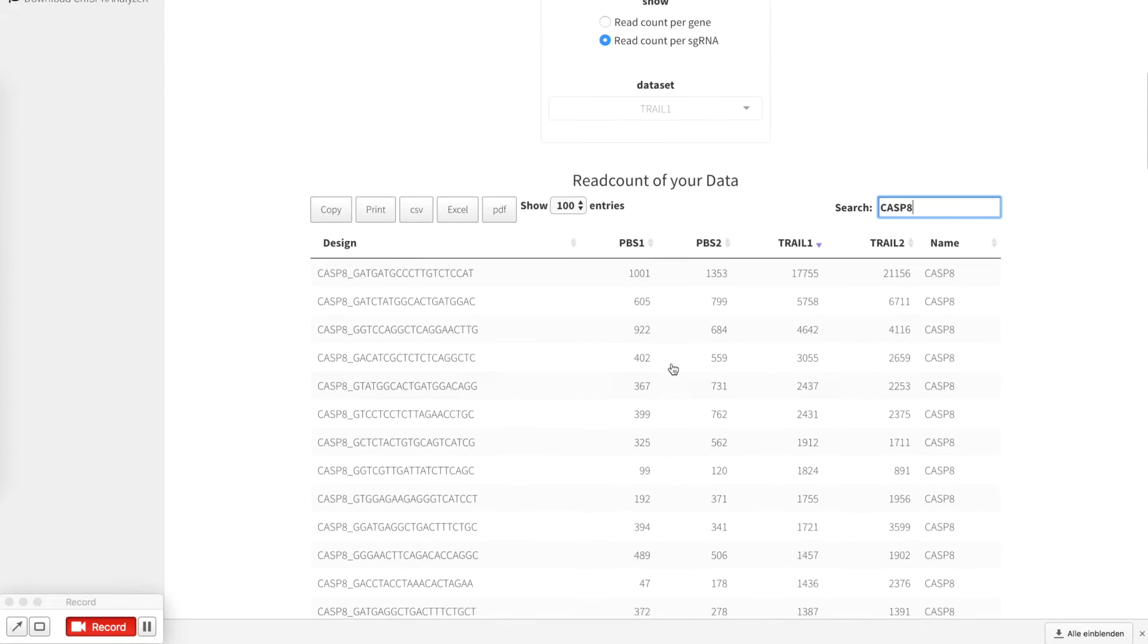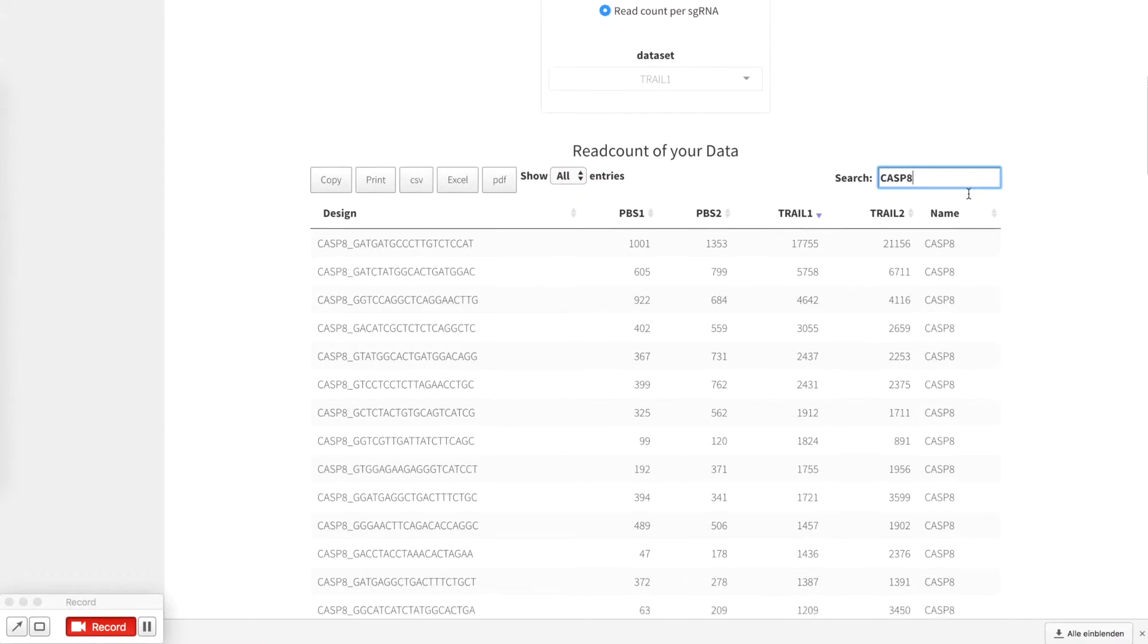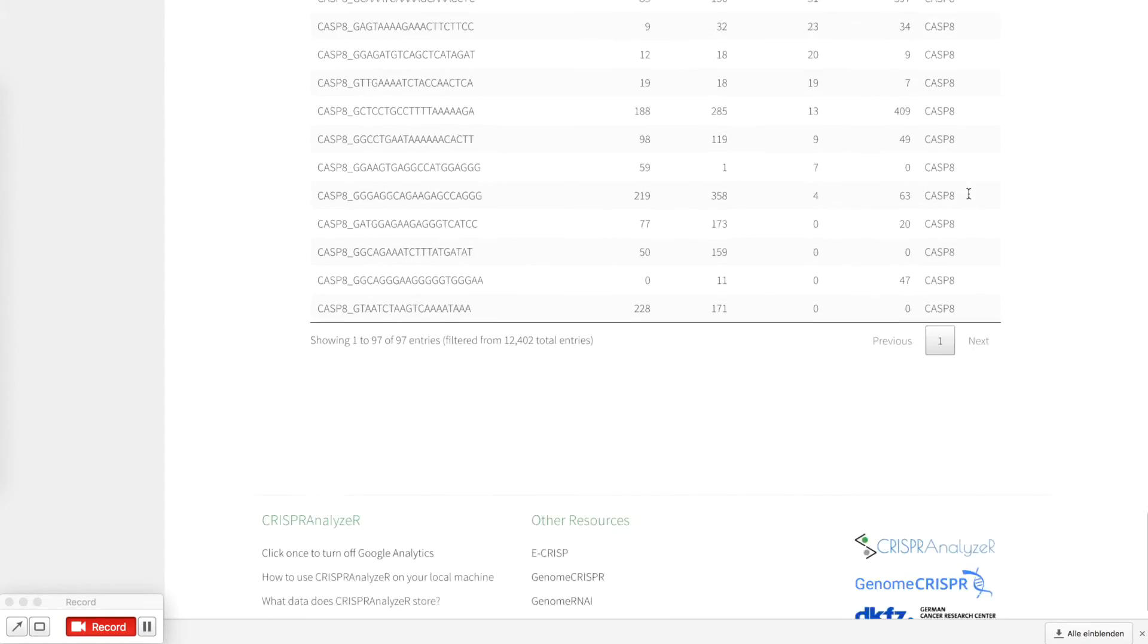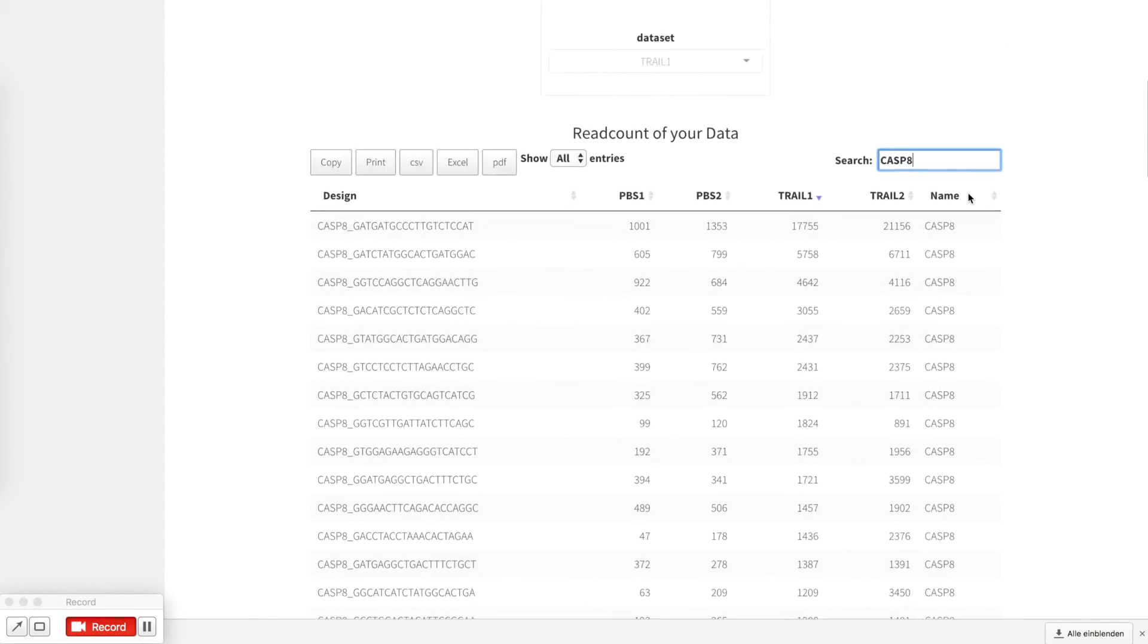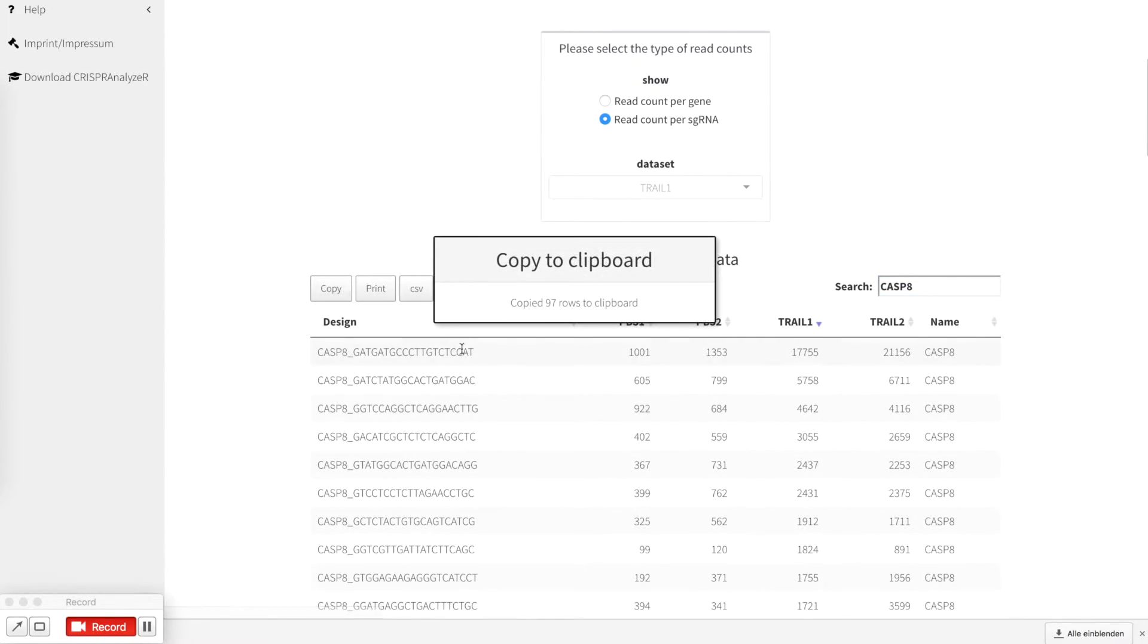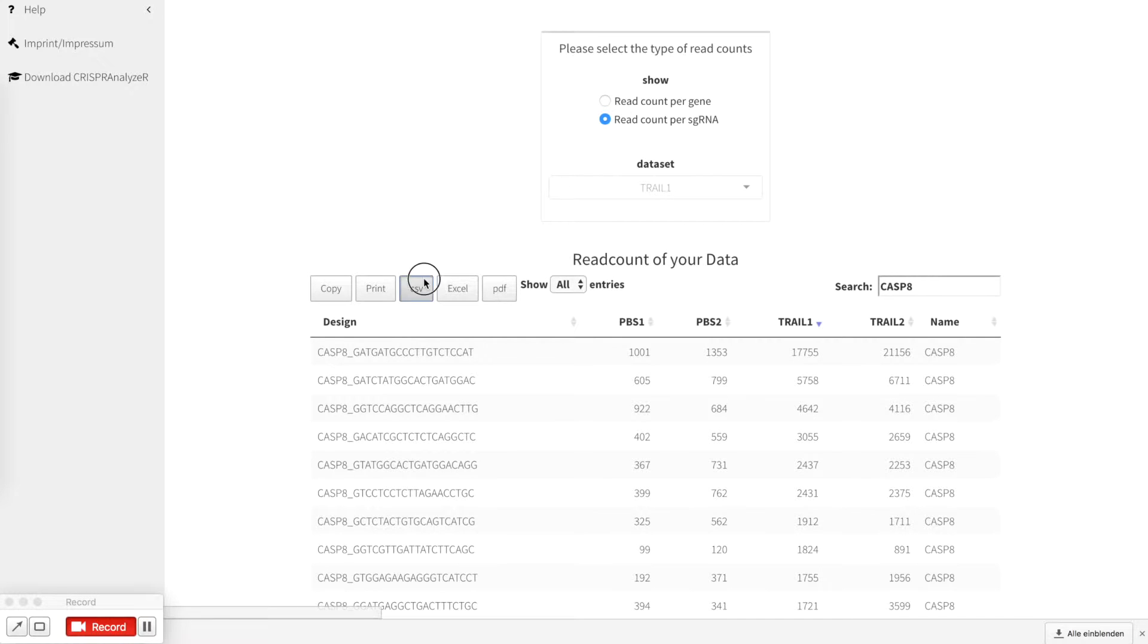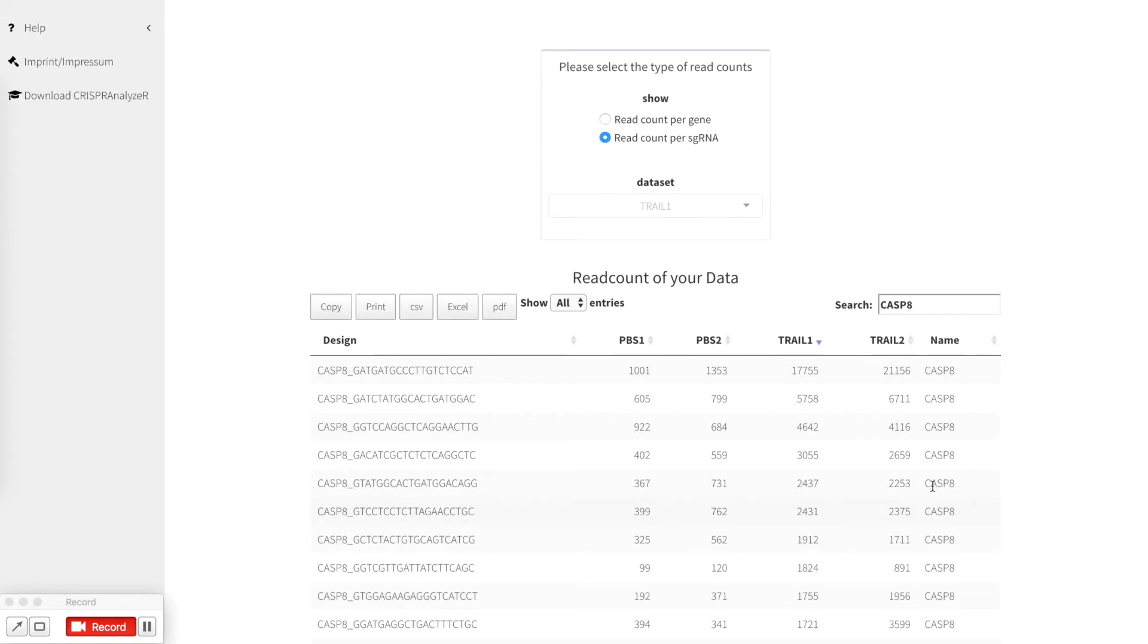If you want to download especially all the data for caspase8 you just click on show all, which is a long list and then you can copy it to the clipboard or you can download it as a comma separated file or as an excel file. It's just as easy as that.